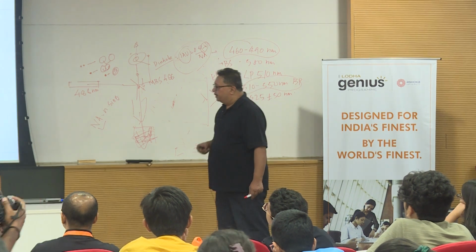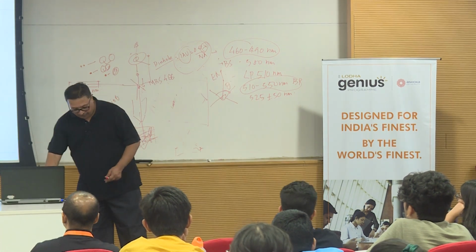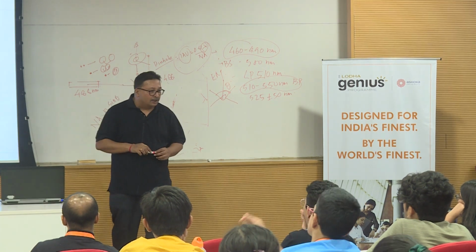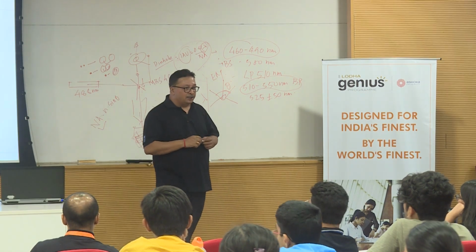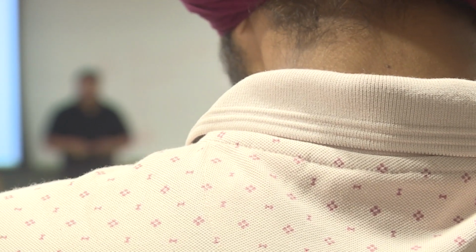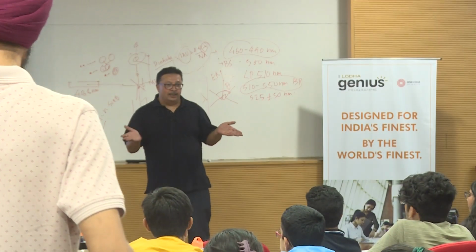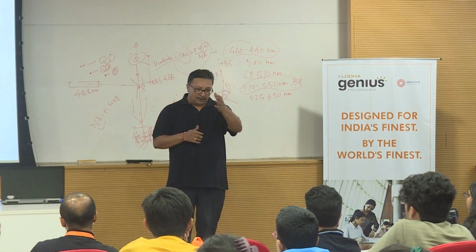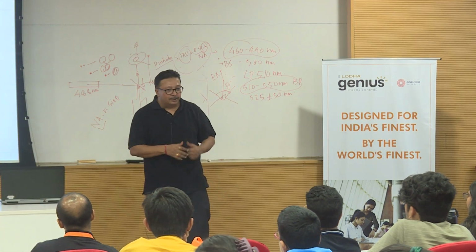Forget about this. Typically when we talk about imaging and fluorescence, we don't talk only about fixed samples, we talk about live samples. We talk about samples that change fluorescence intensity over time, or samples that are quite thick and you want to do a Z stack. So, starting from 2D imaging to 6D imaging. When I say 2D imaging, it means an X by Y image, a single plane. When I say 3D, it means X, Y versus Z, and then you can create volumetric rendered data.